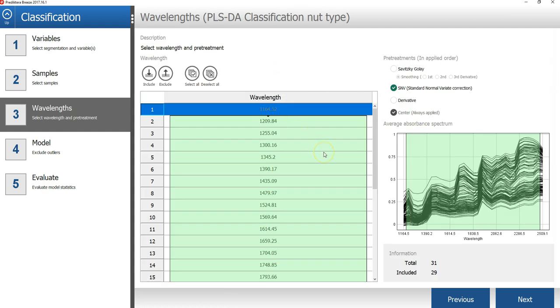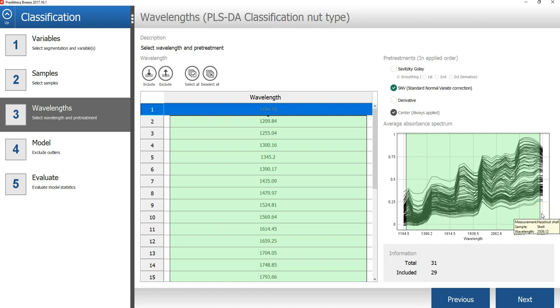In the third step of the wizard, we can see that by default all spectral bands are included, except the first and last bands. By default, Breeze removes the first and last 4% of the bands, since these are often more noise in many spectra cameras, which is OK in this case.